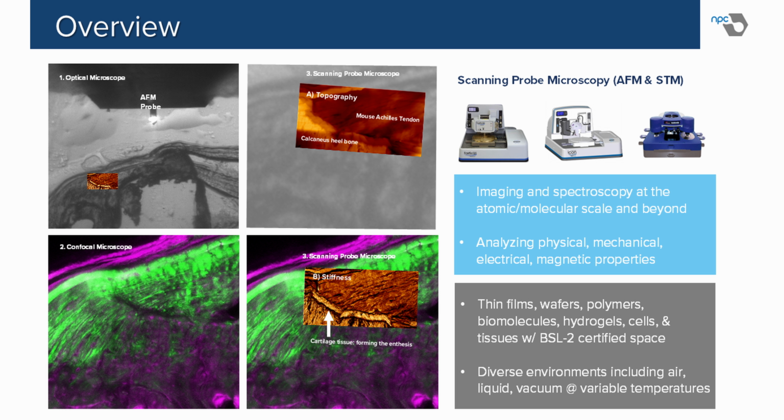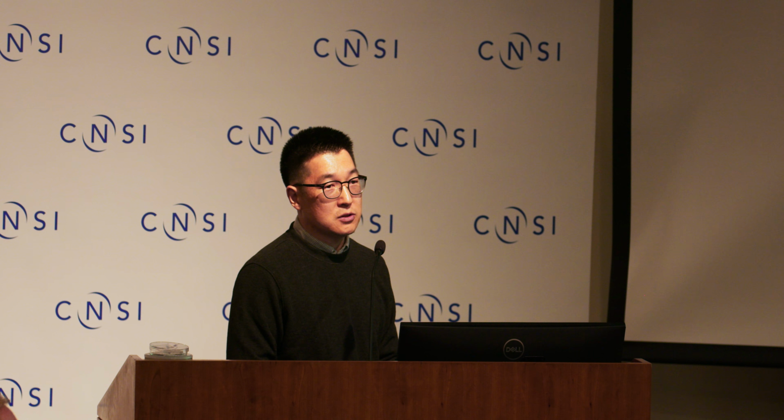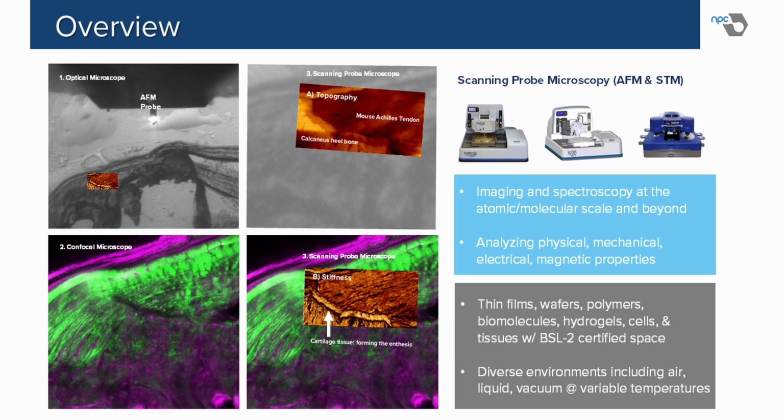Also, we can overlay or map the scanning probe microscope images to see the different topographic information about the size, height, and depth profile. And the beauty of this bio AFM is we can add additional information such as the stiffness in this case. So you can see there are black lines representing the different soft tissues between the junction of the tendon and the bone tissue samples.